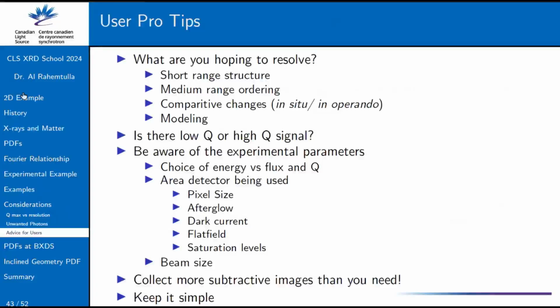And then probably the very important thing that you should know, and your beamline scientists will probably always hammer it in, is the saturation level. How high of a count is going to be the maximum count that the detector can allow? Usually when you go above that, you could be damaging the detector, and also if you're hitting that saturation level, you're not getting anything useful out of it anymore because you don't know if you're hitting a maximum. These are all things that we would tell you, and usually we'll tell you, don't go above 80% of 65,000, which is 16 bits.